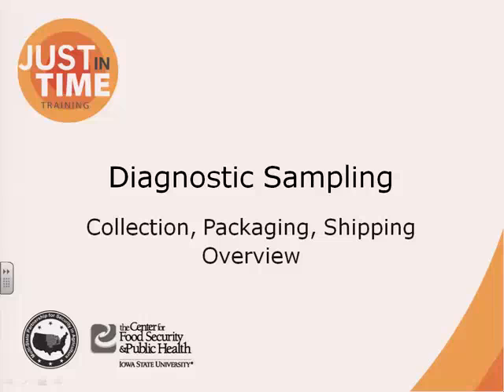During an animal disease emergency, diagnostic sampling will be needed to determine the disease as well as identify infected animals. This just-in-time training presentation will overview basic points to be aware of when collecting and packaging diagnostic samples as well as shipping requirements.